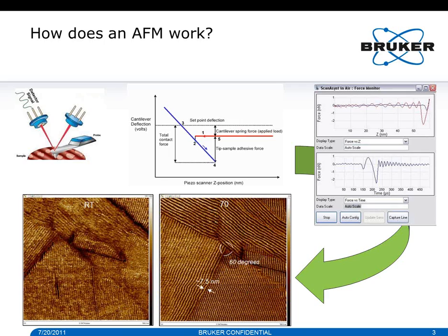The tip snaps to the surface, and from that point on, when you push your tip further into the surface, the cantilever will just deflect. That deflection can give you useful information about mechanical surface properties and so forth, and we can extract that in some of our AFM modes. Then you can take that whole thing and pull it back. And usually when you pull back, as indicated on the blue line, when you come to point number 4, you can actually pull back further than what it actually took to snap the cantilever onto the surface.